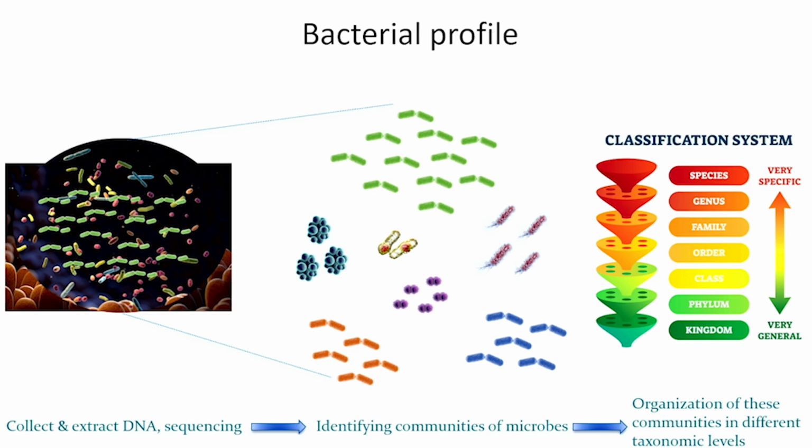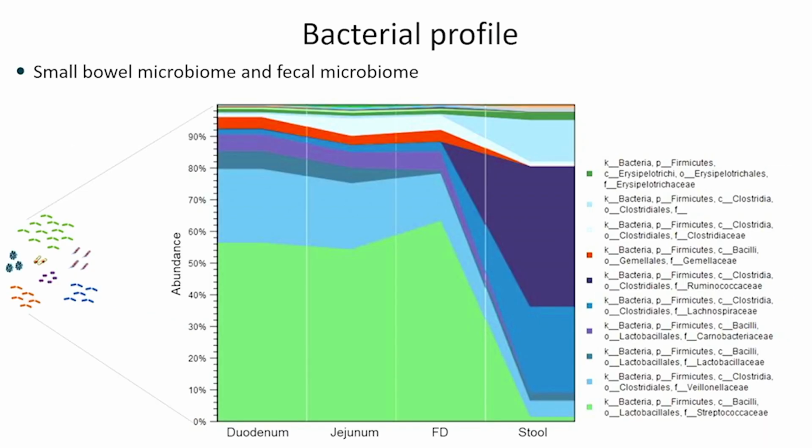Okay, these ones are Escherichia coli, they are from the family Enterobacteriaceae, they are from the phylum Proteobacteria. Okay, these ones are Staphylococcus, so they have a specific family, they have a specific phylum. So we do that, and because we know this information about all of these microbes, and they are present in a specific database, we can now understand the reports that we get, right? The charts that we get representing this microbiome.